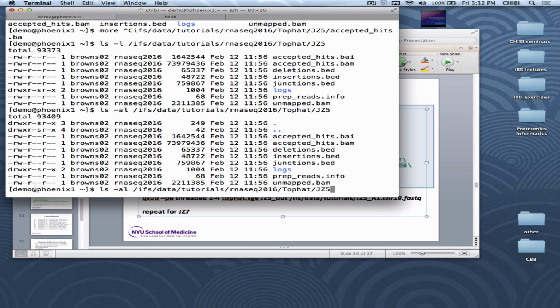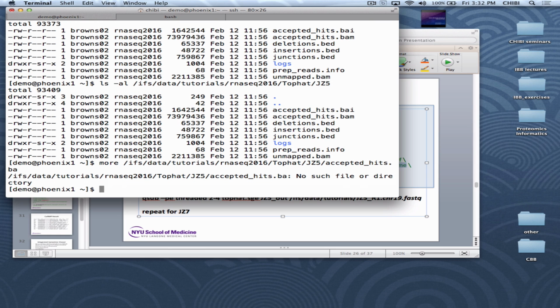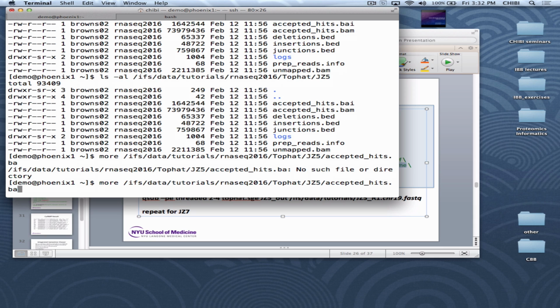Okay, I was going to show you the accepted hits, but that's not happening. No such file or directory. Yeah, sure enough.